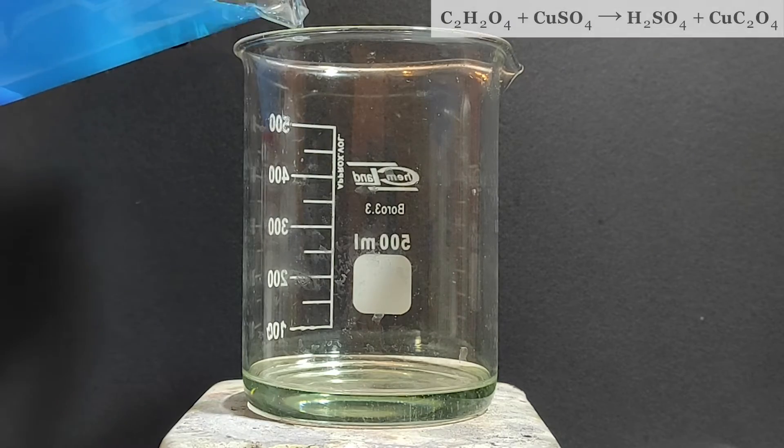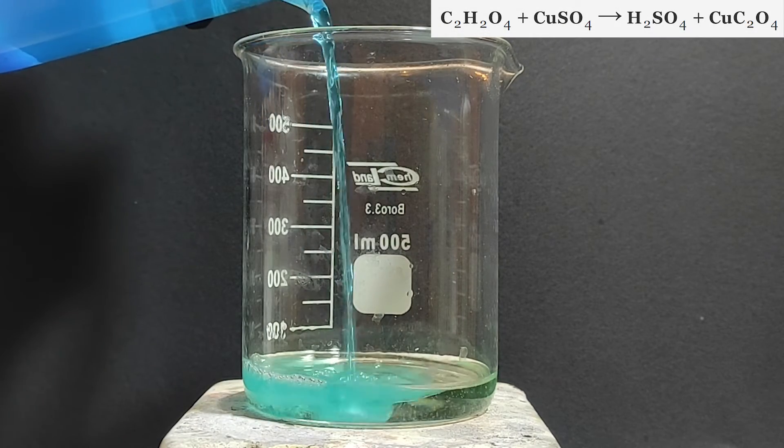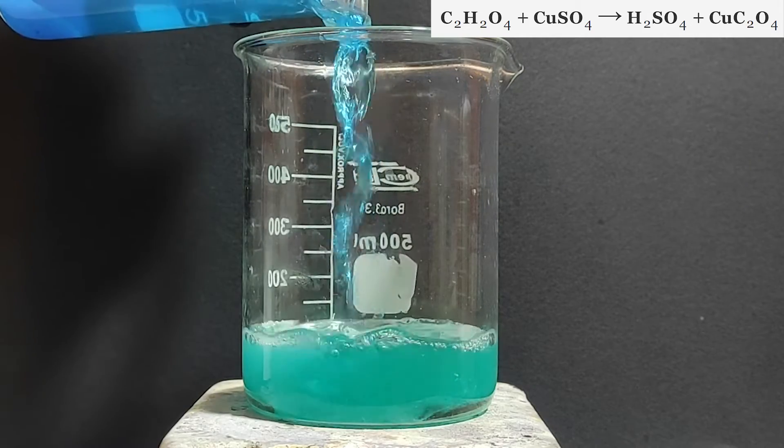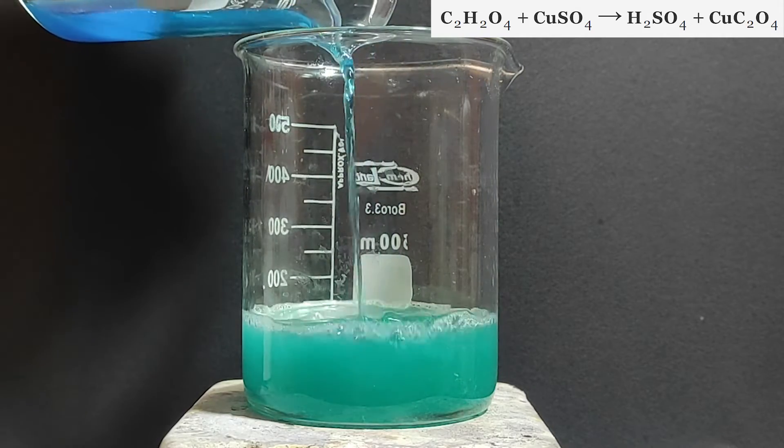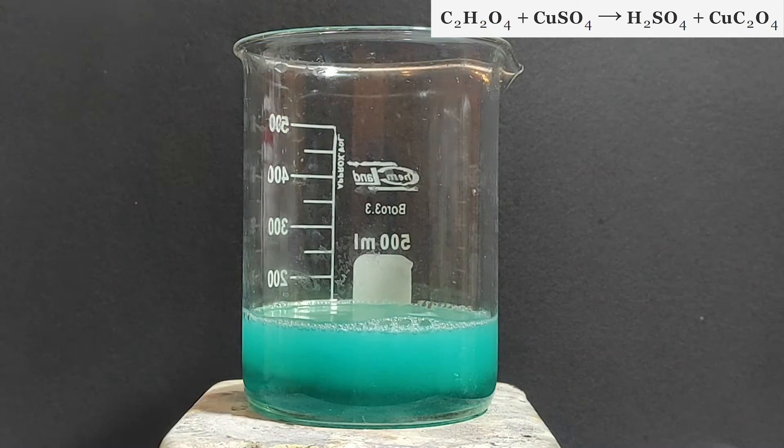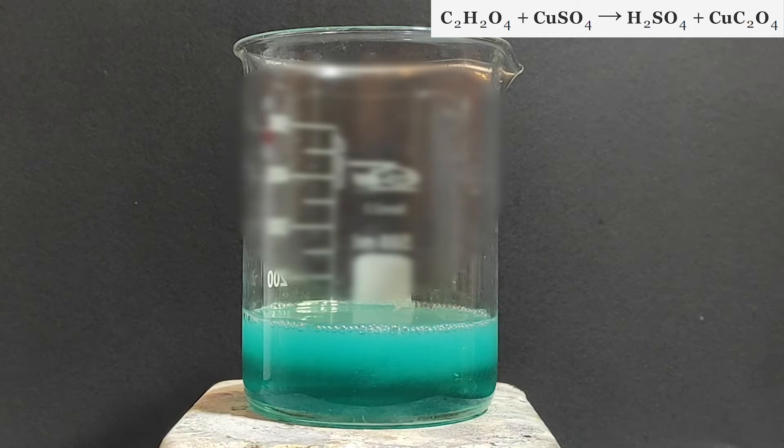So to the oxalic acid solution I've started adding the saturated copper sulfate solution. The oxalic acid reacts with the copper sulfate displacing the two hydrogens in the oxalic acid with the copper ion. This forms H2SO4 which is our sulfuric acid and as a byproduct it forms copper oxalate.